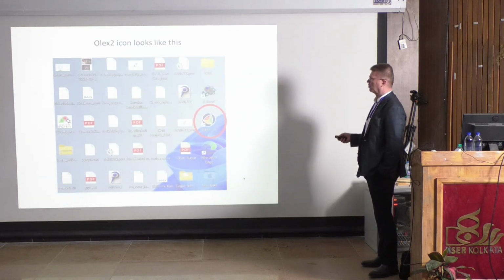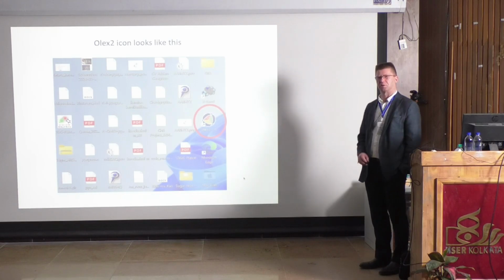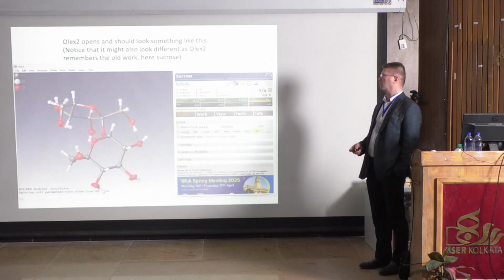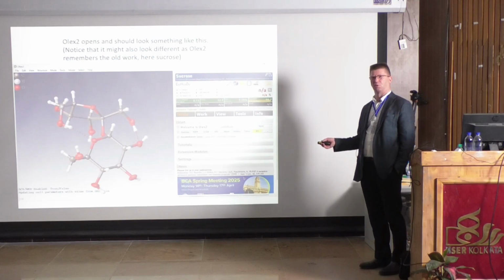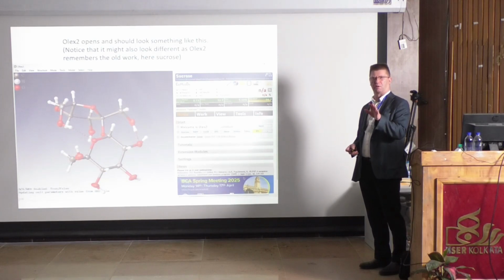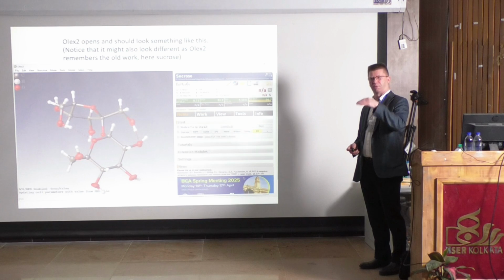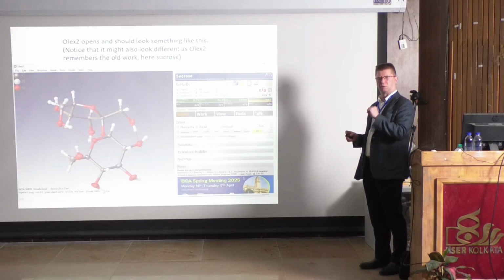We start the engine. So the Olex icon, when you install it, looks like this. When it's there, we can click it and start the engine. It opens, and the opening window looks like this. So we work through these screenshots of the program. There appears a text which says what happens at which time. So it's very easy for you to follow the handout, because you just follow exactly what is in the handout with your own program, then you can easily get it.